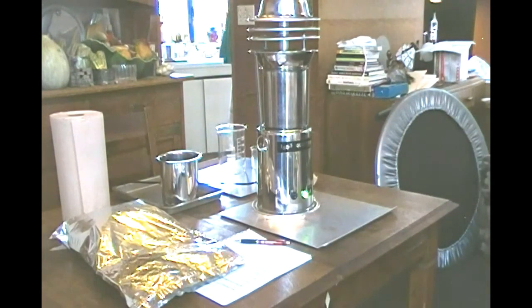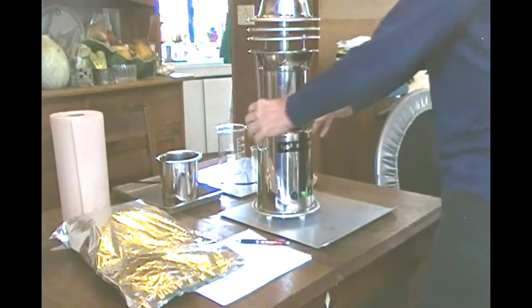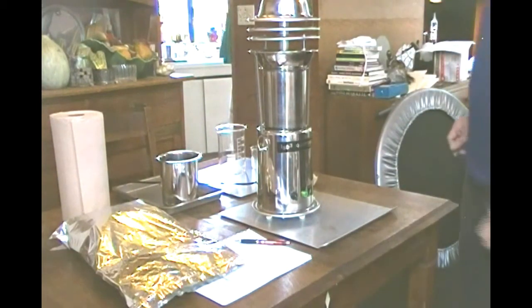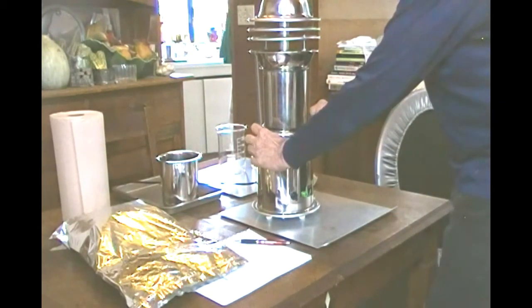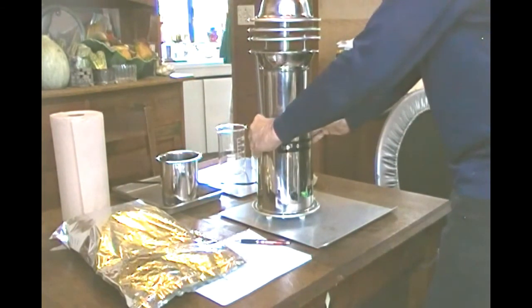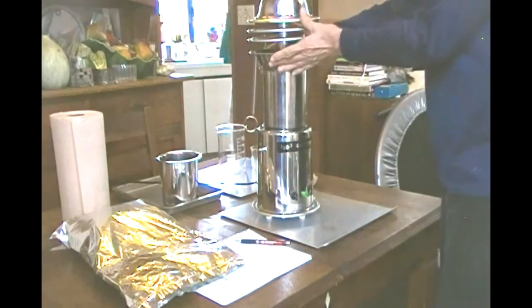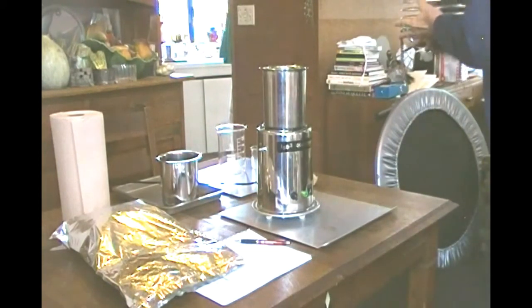Okay, this has been running for 24 hours. Now we're going to open it up. The first thing that I do is turn off the switch. Next, I grab the two rings, and like I was saying before, we pull down on them evenly and in a practiced manner so that we can separate the condenser from the unit without the condenser up here moving. Once you practice this a couple of times, it gets real easy. So we lift the condenser off carefully, and I'm going to go dump the water from it in the sink.